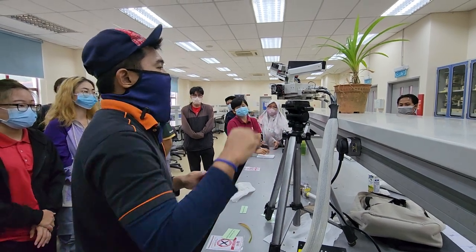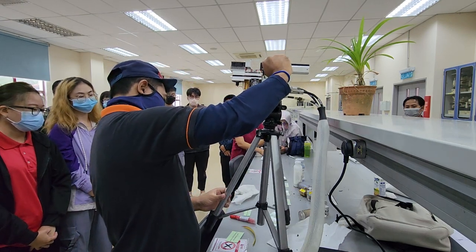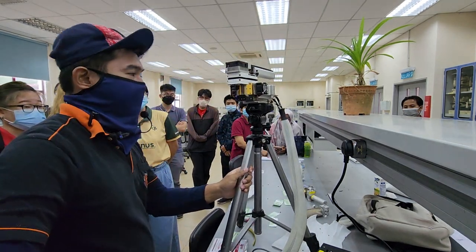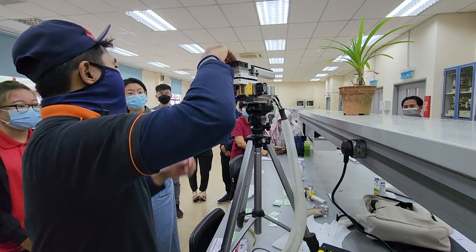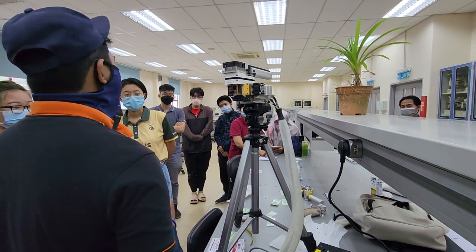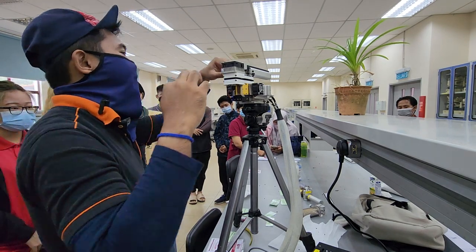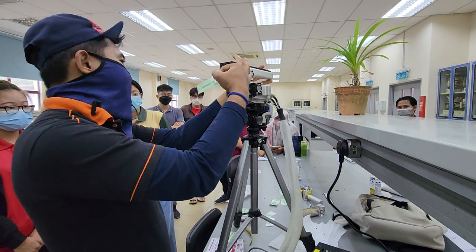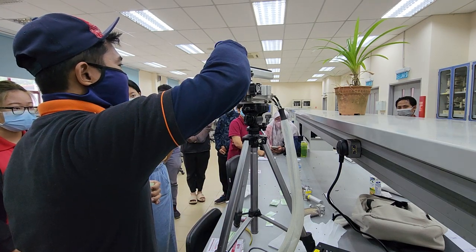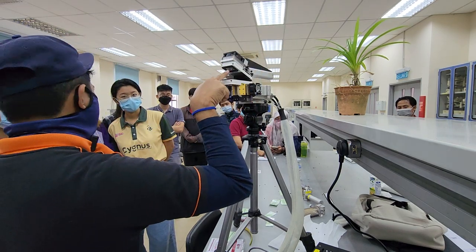Then what else? You've got your fan, that's a regular part of it. Can you see this thing here? This is actually the quantum sensor. Light sensor. Quantum means light. No, quantum doesn't mean light. Quantum means the packet of energy. I don't want to sound too crazy about it. So this IRGA chamber has two light sensors. One light sensor is present here on the outside. The second light sensor is actually in here.